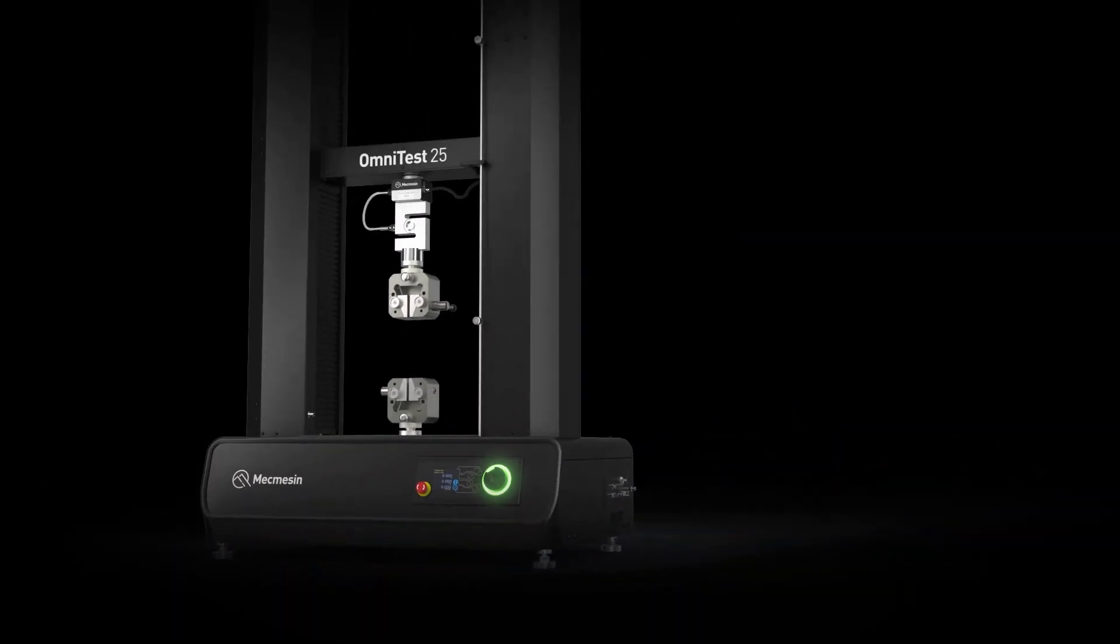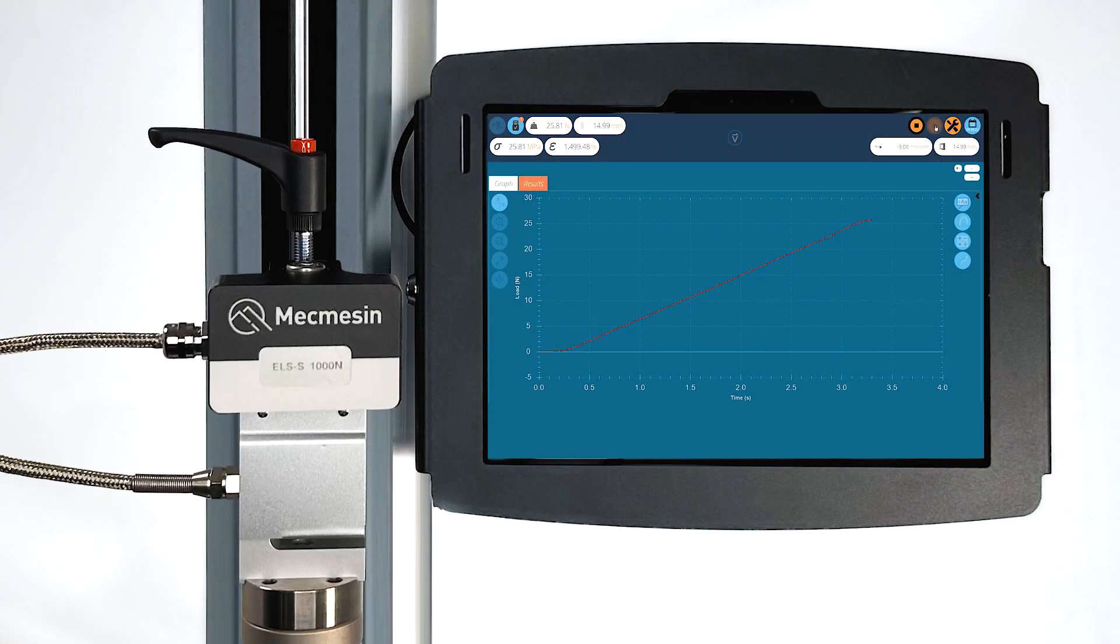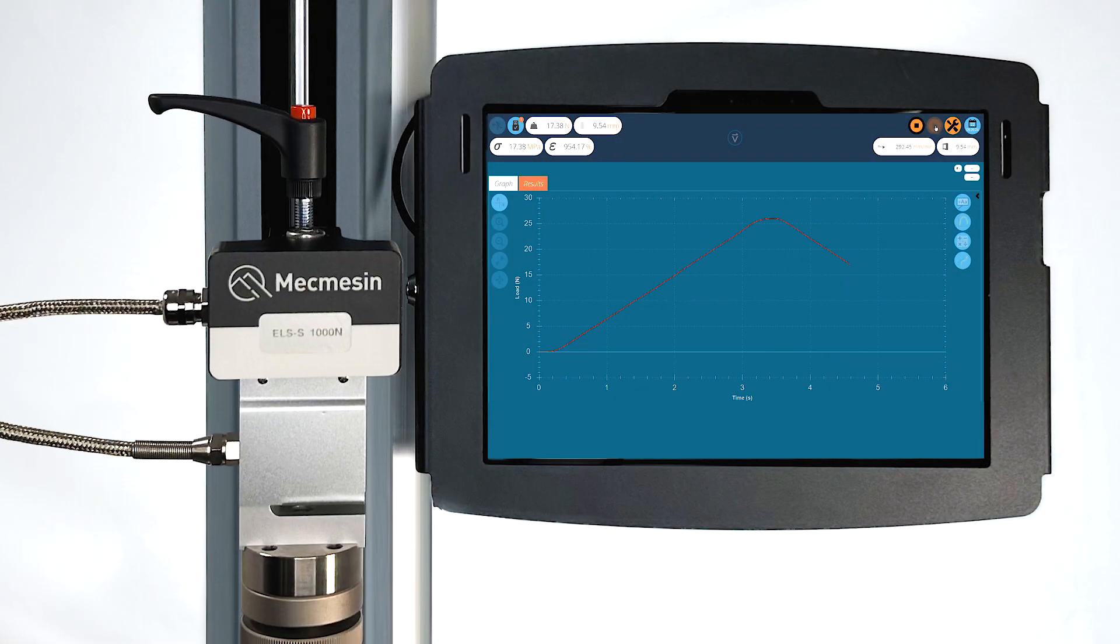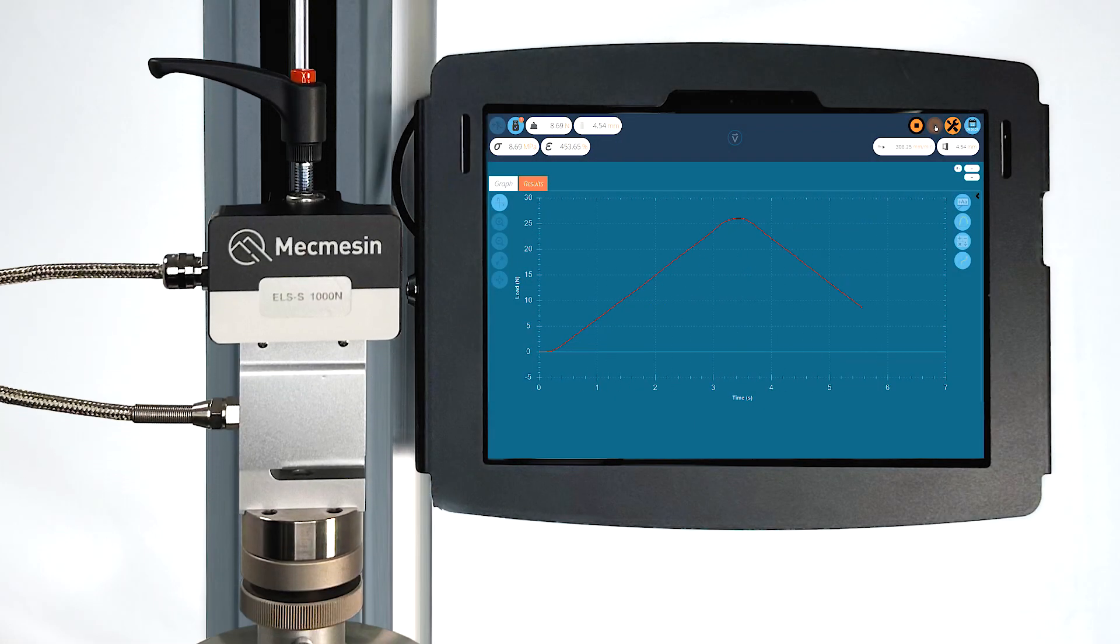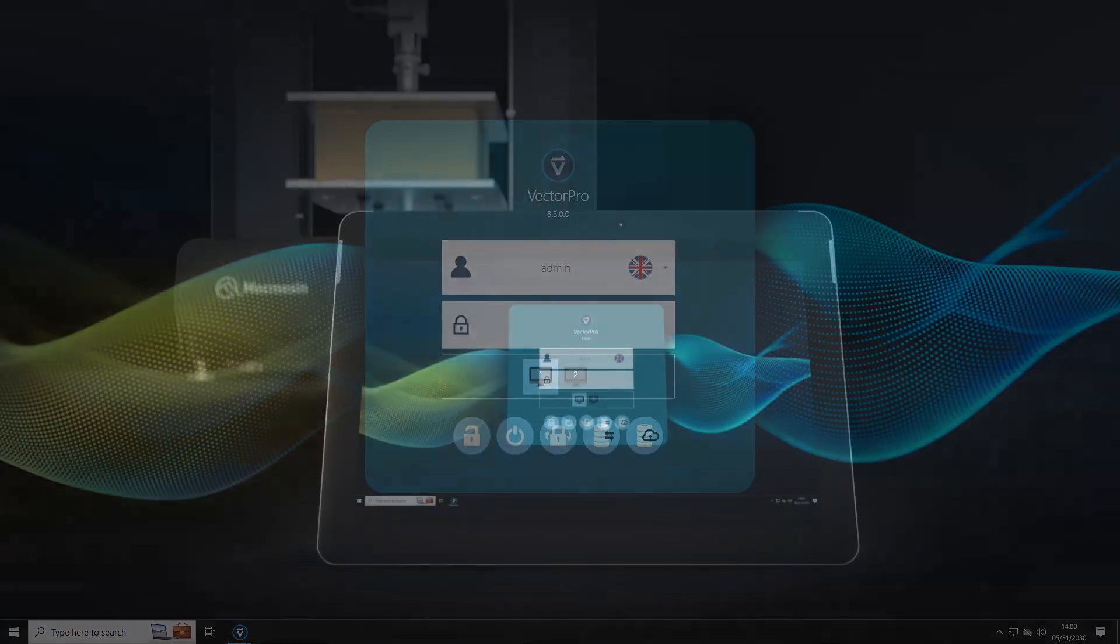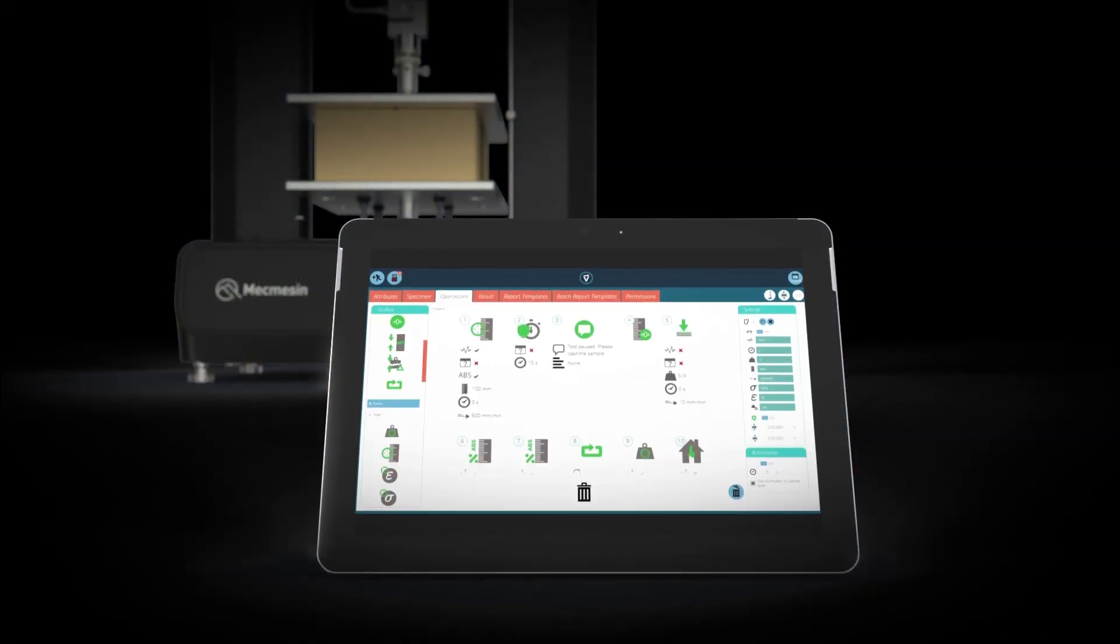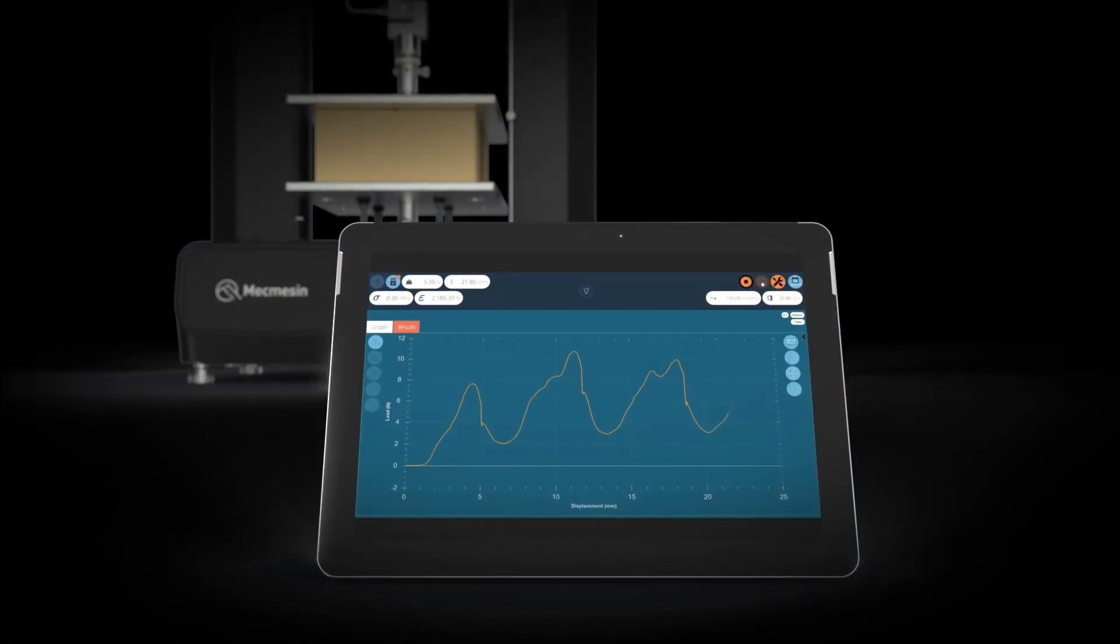These versatile universal testing systems are powered by our intuitive Vector Pro test software, making them easy to use for implementing quality assurance standards across all industries.